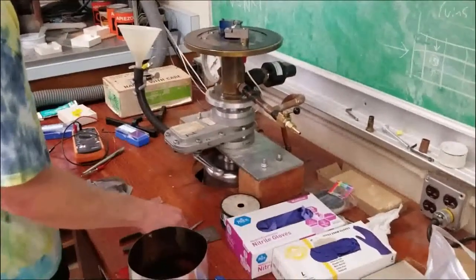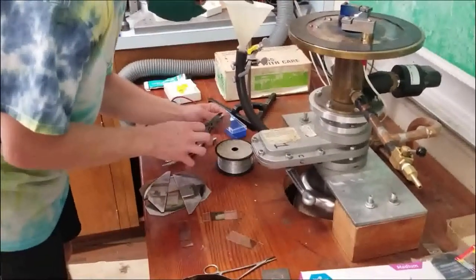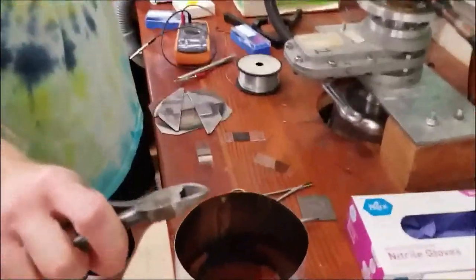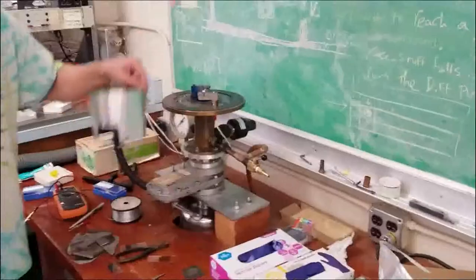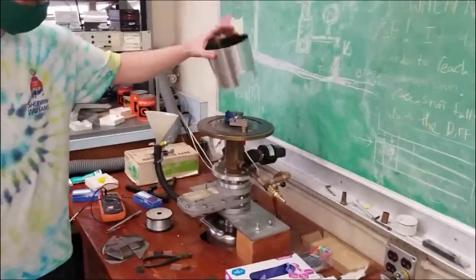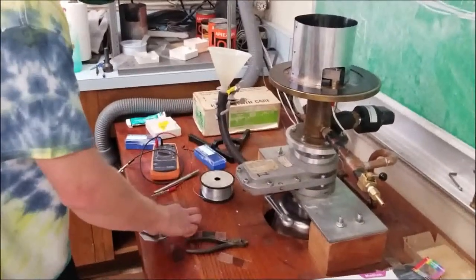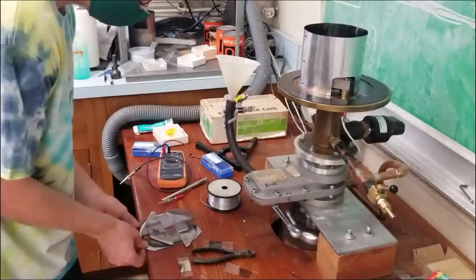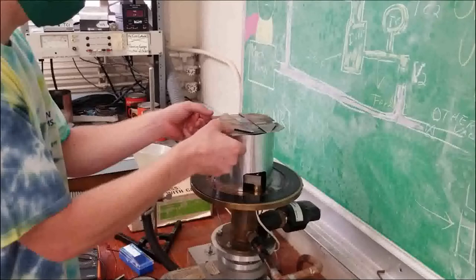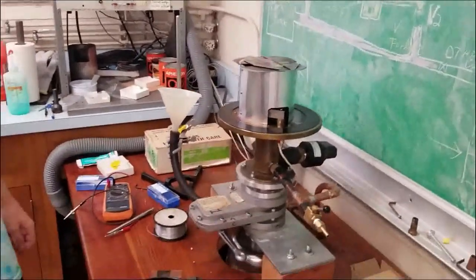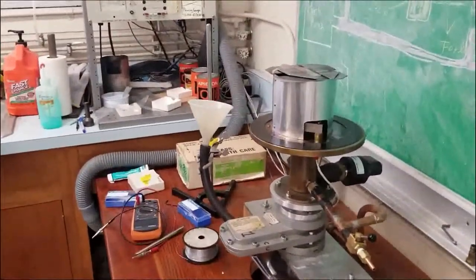You should be wearing gloves when you do this part but I'm just not going to touch anything I'm not supposed to. The reason why is because the oil on your hand will sublimate when it's inside there. And you need like barely any aluminum at all. That's probably enough. So I'm just going to grab it with my little thingies. Make sure these aren't touching the electrodes otherwise the electricity will just conduct through this. That's a common mistake. Honestly though the amount of oil that gets in here from your hands is so small, it's okay if you do it once or twice. But you never know what they're eating before they come to class, maybe they just have a ton of bacon and get bacon grease all over.